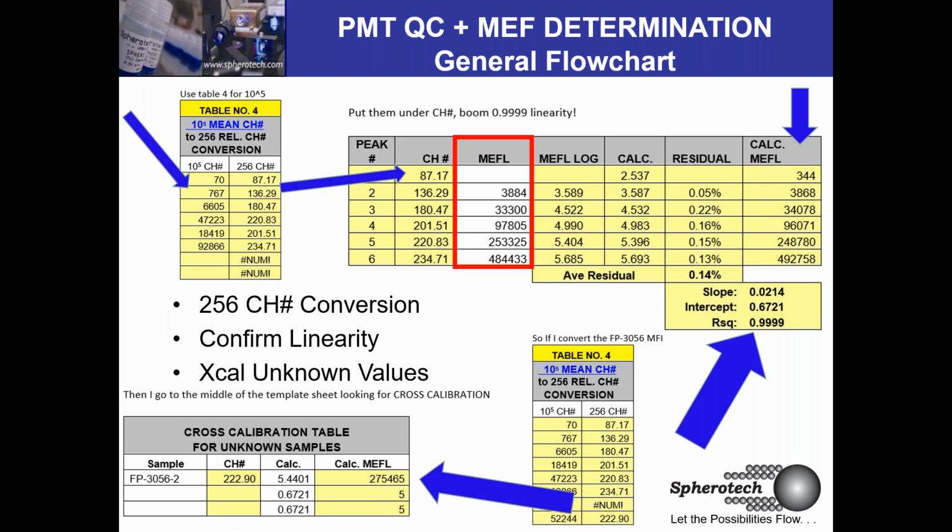If you do this with 15 or 20 samples, if you do this with a longitudinal study, not only that, but the beads stay the same. Unlike your viability of cells, you can say, 5 years later, the brightness of the beads is the same, or at the very least, it's validated.